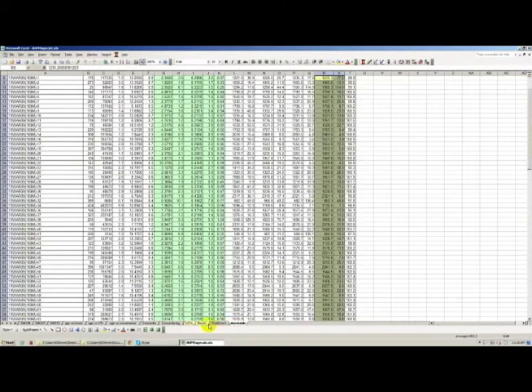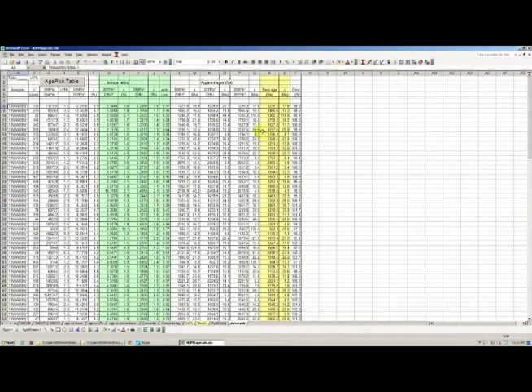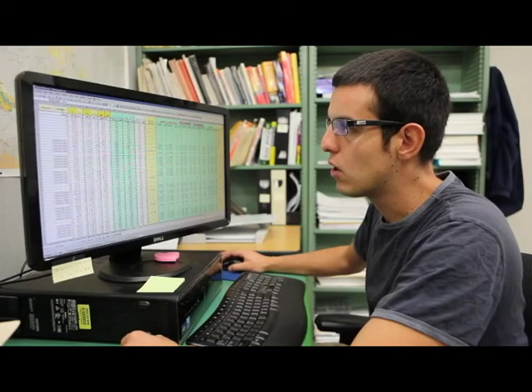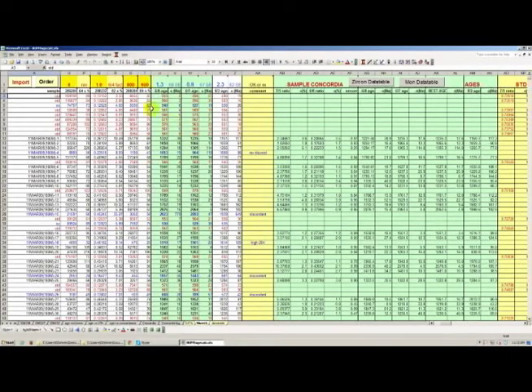So an important thing to remember is that every time you change one of these parameters and hit order, you also want to click on the zircon data table again. It's going to export all those values back to the data table, and that's going to represent the changes that you just made, every time that you hit order and recalculate some of these values and reapply some of these filtering thresholds.